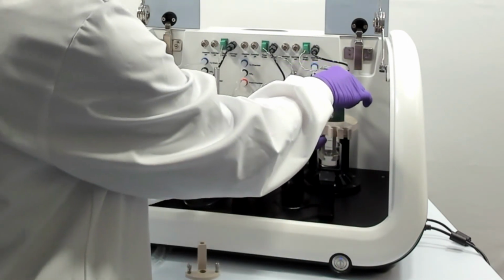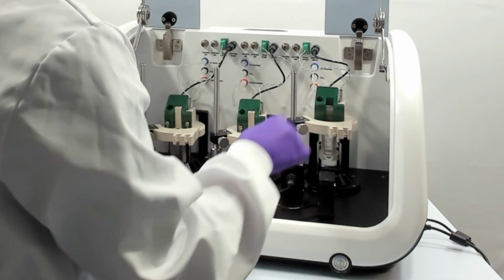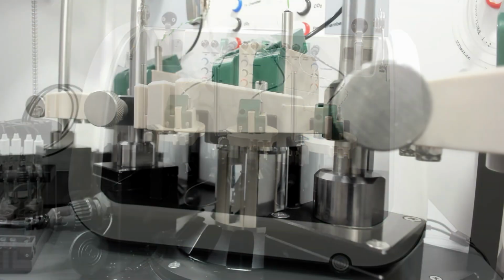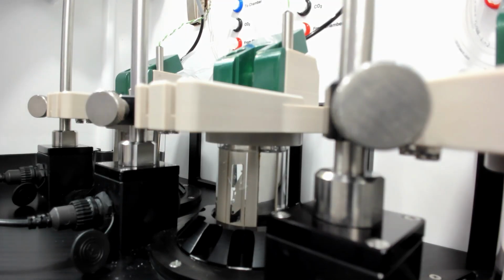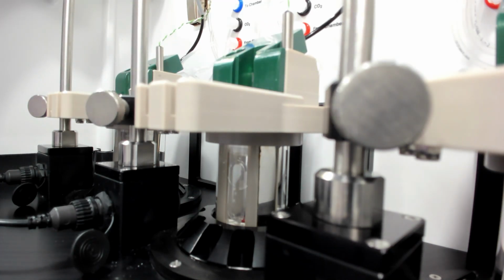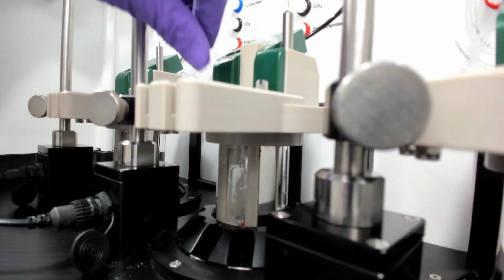So in this scenario, the cartridge acts as the subcutaneous space, and the outer chamber acts as the interstitial fluid, or the uptake to the blood and lymphatic vessels. So if we look here, we can see us entering the cartridge into the cartridge holder, and then putting the probe holder back in place and securing it with the pins.